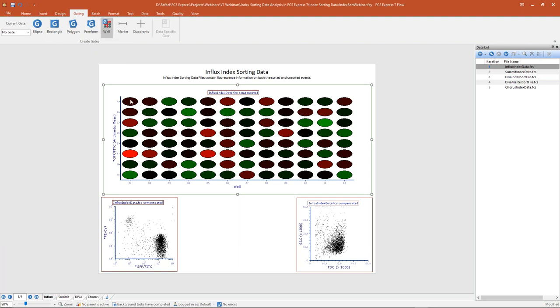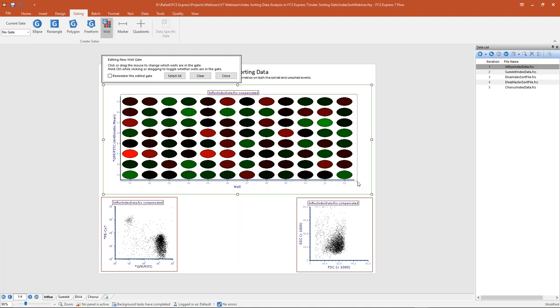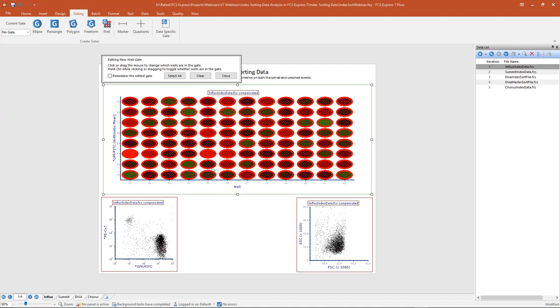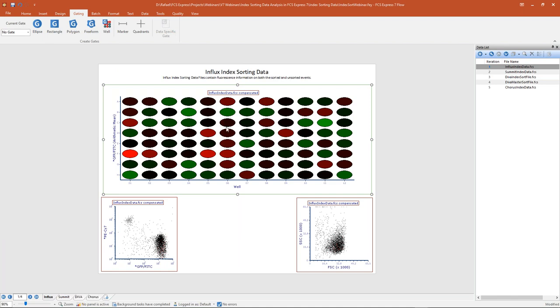When I click that, I just need to pick one of these wells, or in this example I'm going to draw a rectangle around all of the wells on my plate, making a gate that encompasses our entire plate — all 96 sorted events. I'm going to call this gate the 'all wells gate' and leave the gate color as red. I'll click OK, and you can see all 96 wells have been selected and the all wells gate has been created.